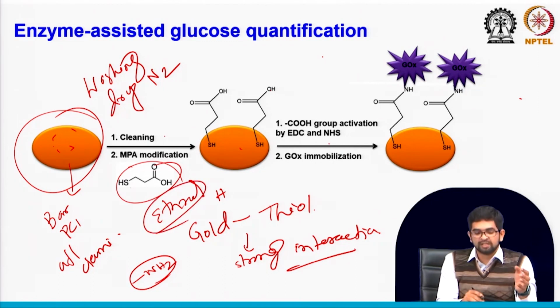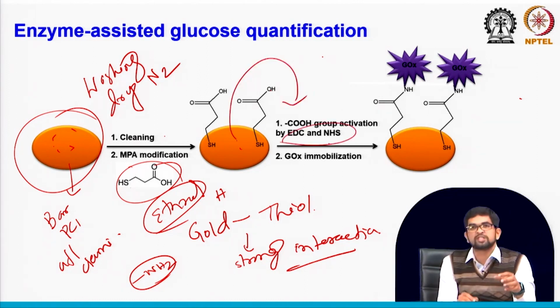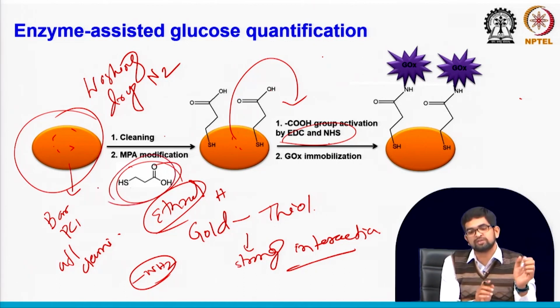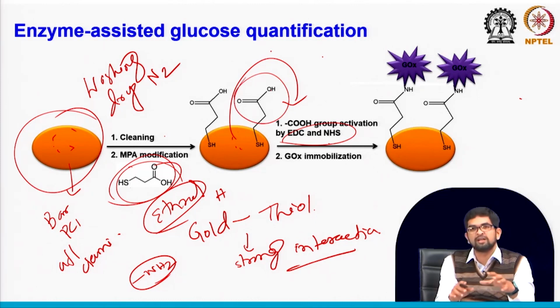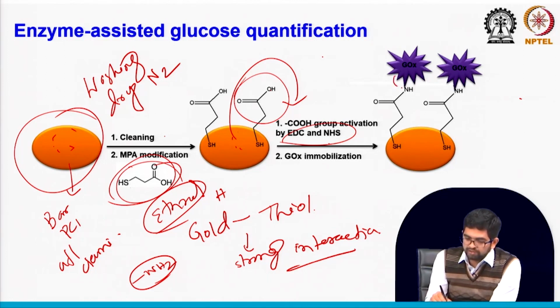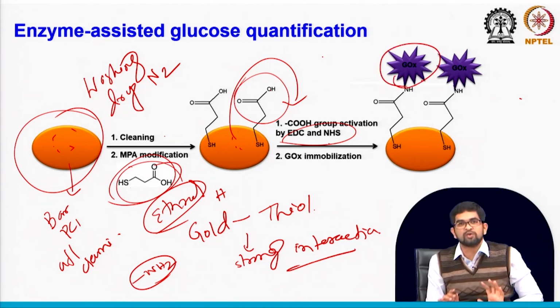So after the modification with the ethanol solution, wash it thoroughly, then dry it, and then you can dip this surface in the EDC-NHS solution. After that you have to clean it properly. There should not be any unbound molecules, otherwise when you add the glucose oxidase, they may bind with the other unbound stuff there. So you have to be very careful with the washing step during the modification of the biosensor surface. Okay, so this biosensor is now ready for glucose detection.